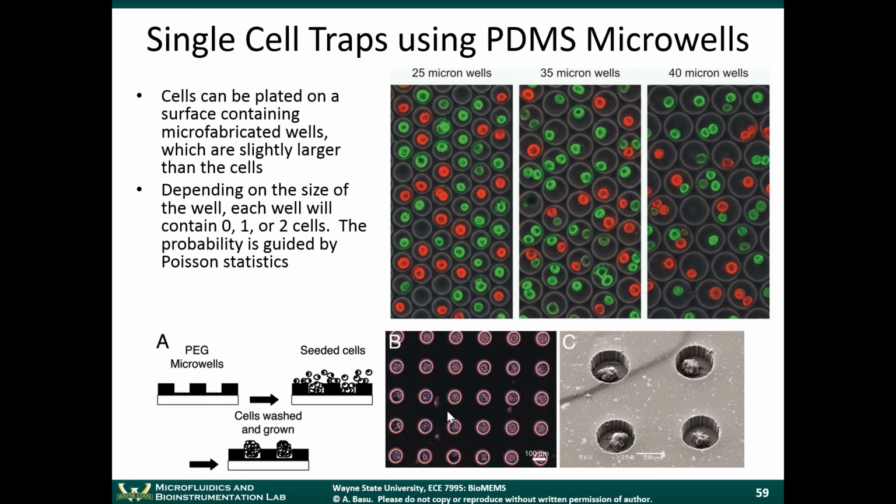I think it's an interesting topic, so please do look over this later. It's a way that you can create single cell traps for studying large populations of cells one at a time.